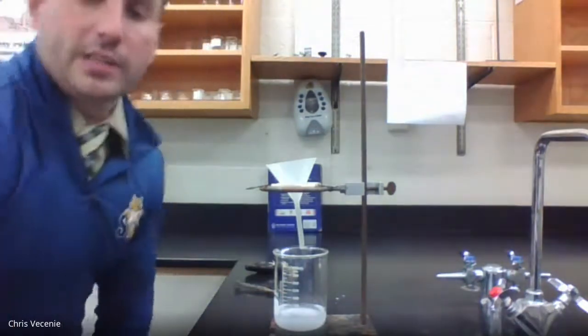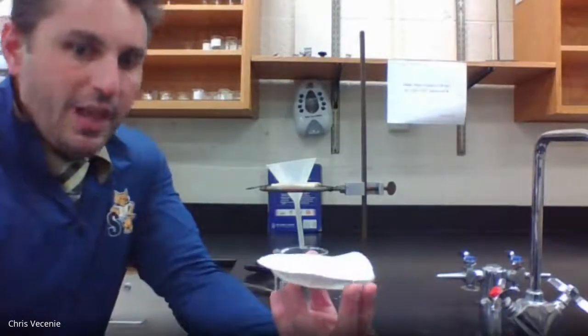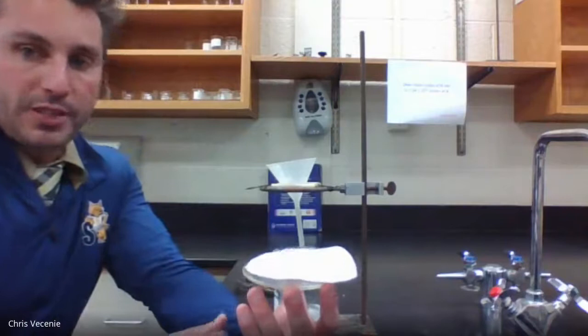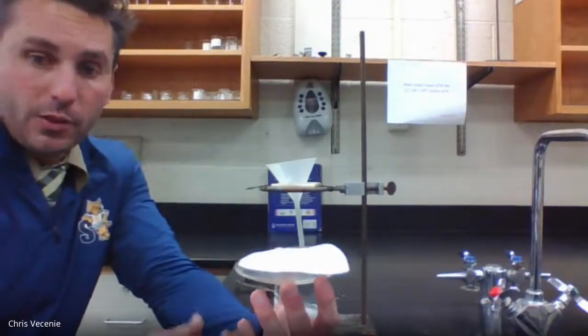Hypothetically, let's assume that was long enough to dry it. I would bring the substance back up, and now I have a dry piece of filter paper that should have my precipitate sitting on top of it. The last thing I would need to do is get the weight.